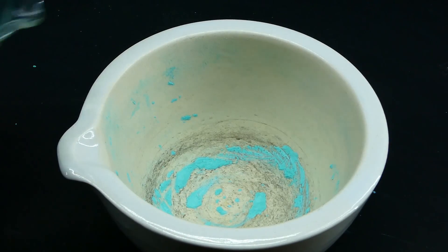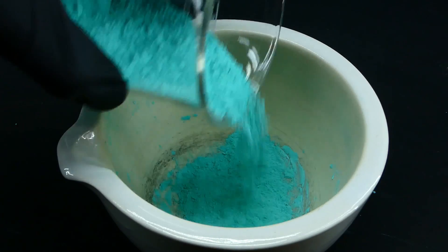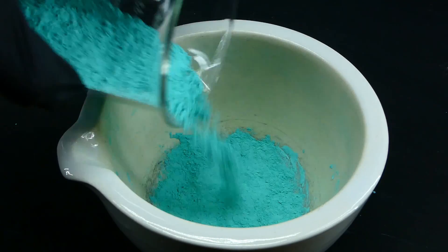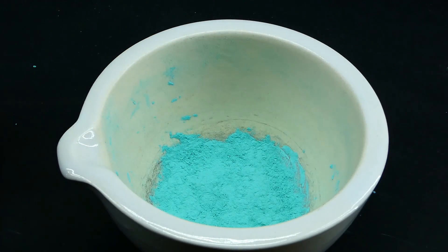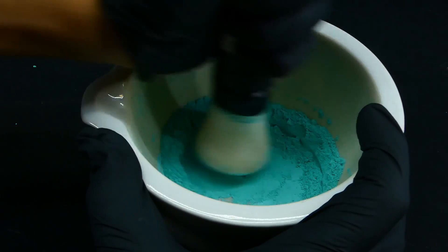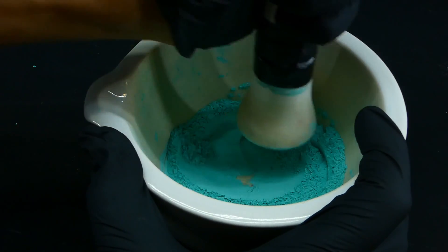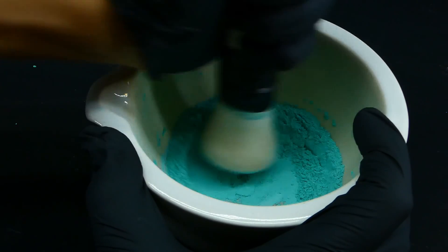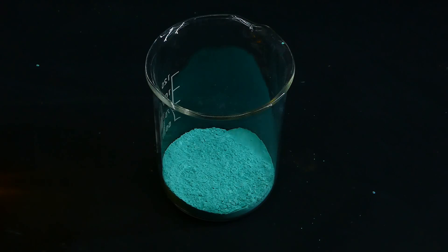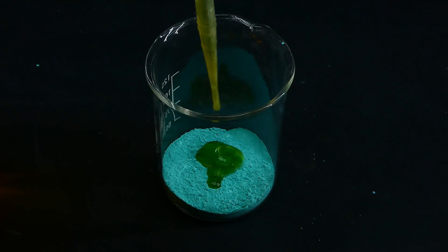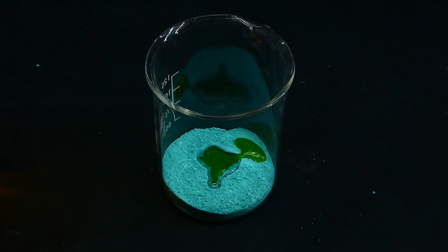Basic copper carbonate was actually used as a paint in ancient Egypt, and I wanted to recreate it. So I got some of the basic copper carbonate powder that I made and ground it down even more so it would make a better paint. I then got some linseed oil that I bought a few months ago and added some of it into the powder.